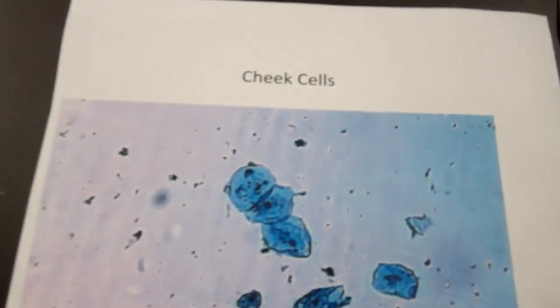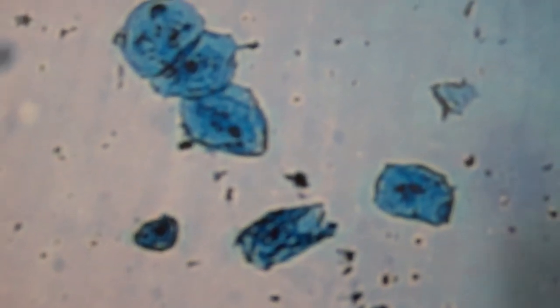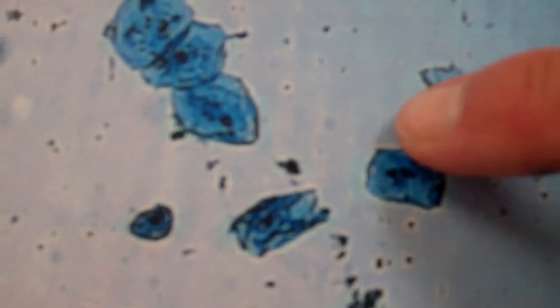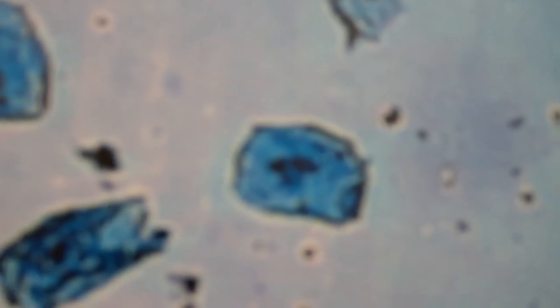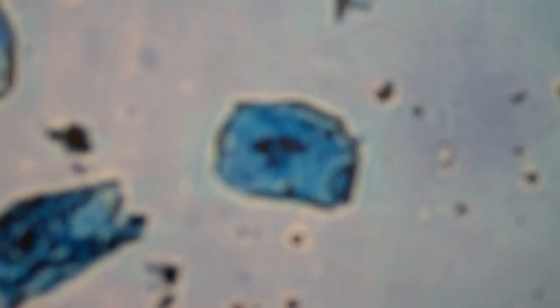And this is what they should look like. You can see the cell membrane is the outer edge because these are animal cells. And the dark blue inside the cell membrane is the cytoplasm. And you can even see a nucleus on this one, but you don't have to draw or label the nucleus on your pictures.